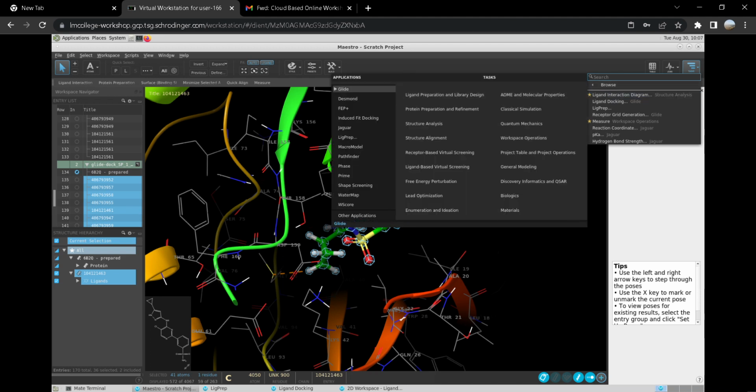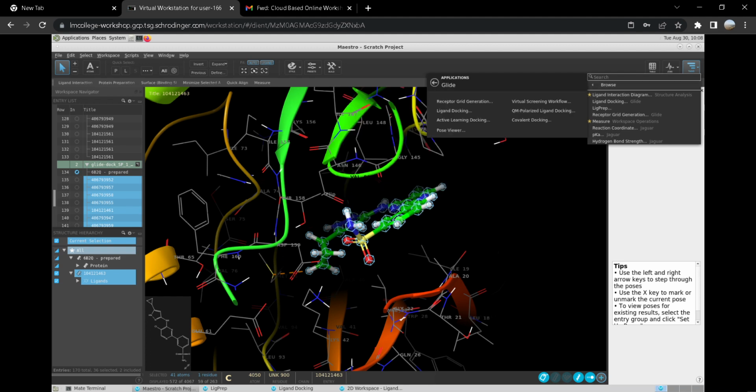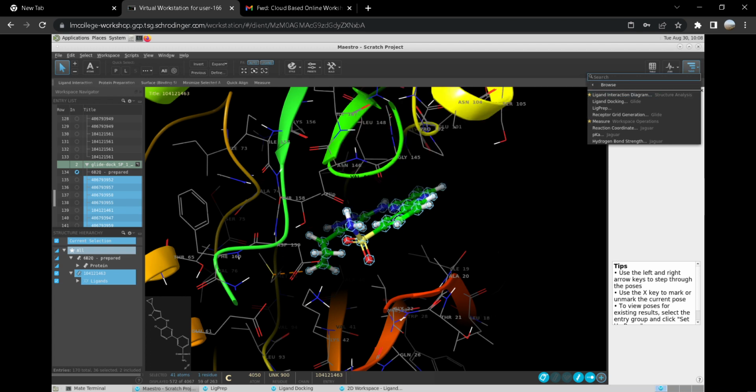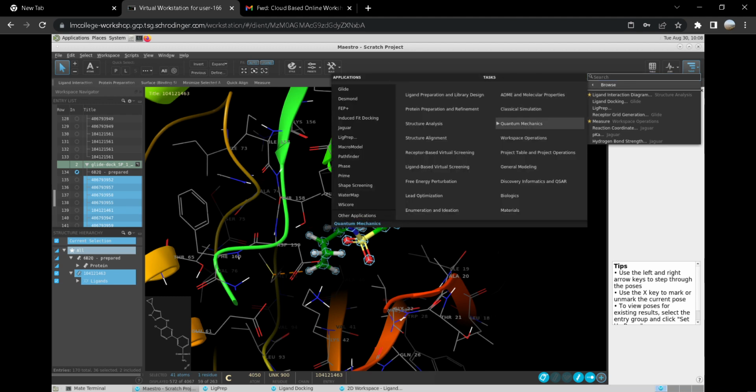And if you put your cursor on any one of these side chains, these amino acids here, you can see which atom of the amino acid is facing the ligand molecule. And if it's a backbone or a side chain, you can see all the information in one single panel here. So this is quite useful information. Now that you have this data, you can see exactly how the binding pocket is shaped.